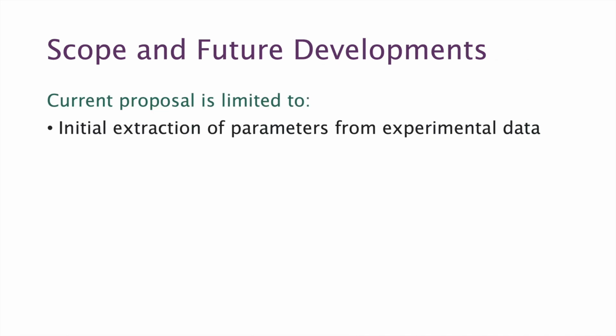This proposal currently only includes the initial extraction of rates from experimental data. It does not include further modelled analysis, be it the extraction of order parameters, populations, or the use of detectors. Although it is by no means impossible to specify models accurately and systematically, it isn't entirely straightforward either, and we are keen to get the ball rolling on the raw relaxation data.